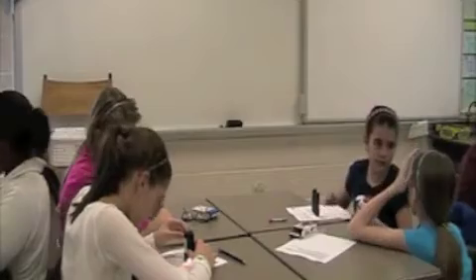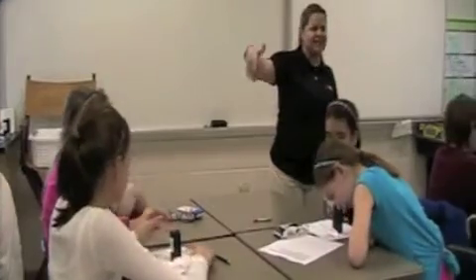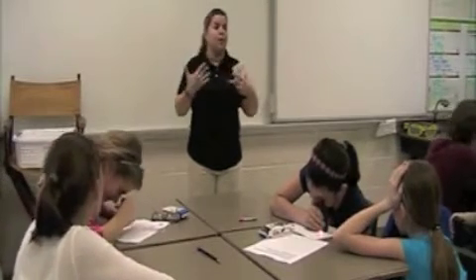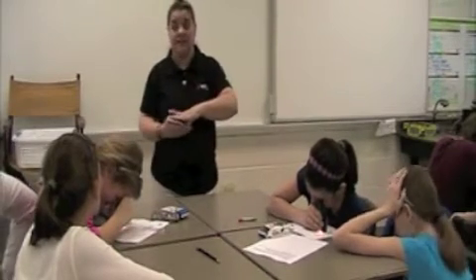Oh, she notices the lens did something funny. It flipped the image upside down. It does do that. Interesting. Microscopes do that. But a lot of times when we're looking at evidence, whether we're seeing it right side up or upside down, it won't matter to us. So the fact that the microscope does that actually won't affect us studying our evidence carefully.